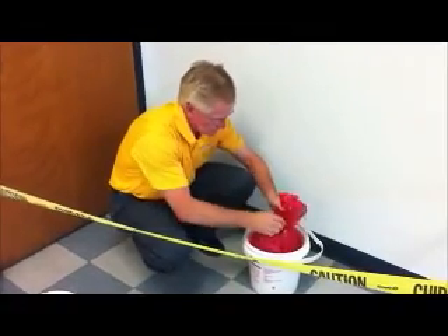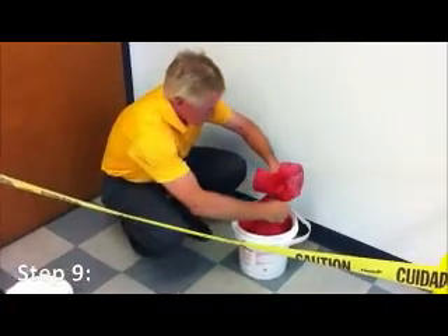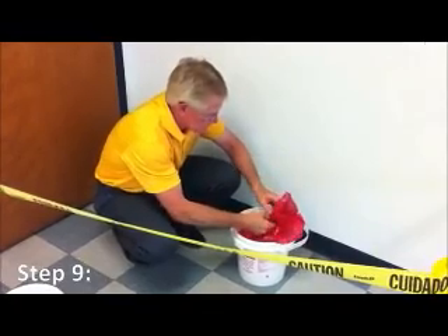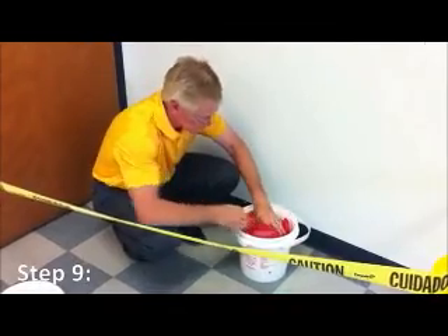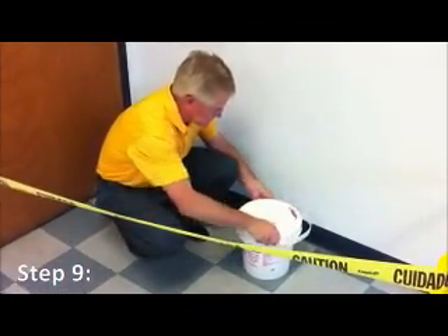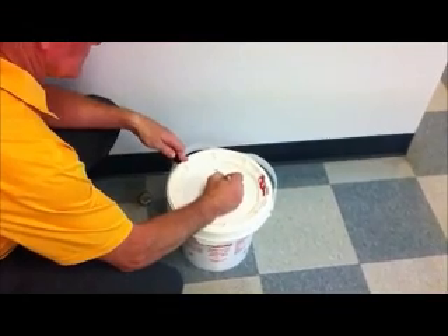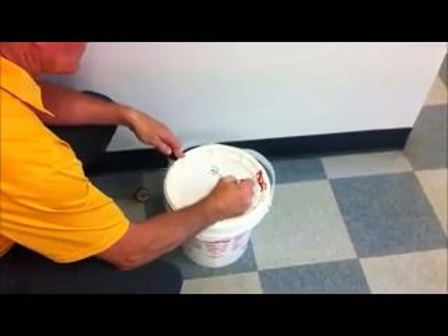Step 9. Close the top of the red biohazardous bag and, using the twist tie included in the kit, securely tie the top of the bag closed. Step the bag into the bucket and replace the top of the bucket securely by twisting. Using a permanent marker, label the top of the bucket as regulated waste and include the date the kit was used.